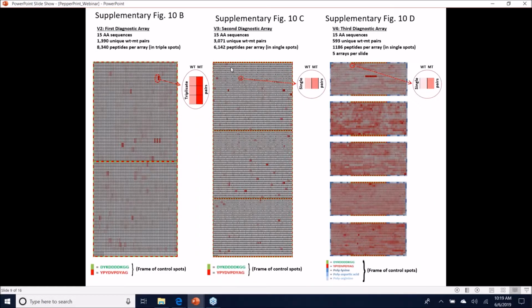And we downloaded most frequently mutated cancer genes for what we call version 4 diagnostic array, which is essentially looking for highest frequency mutations that are present in there. And we have a criteria for a mutant site has to be at least 17 times mutated to reduce the background. And then each of the nucleotide changes has to be at least 10 times and things like that. That was determined upon looking at the background frequency.